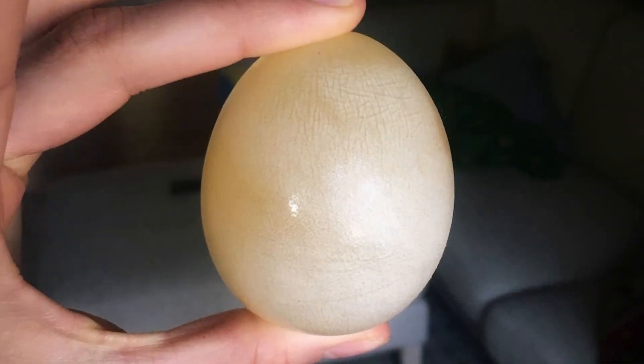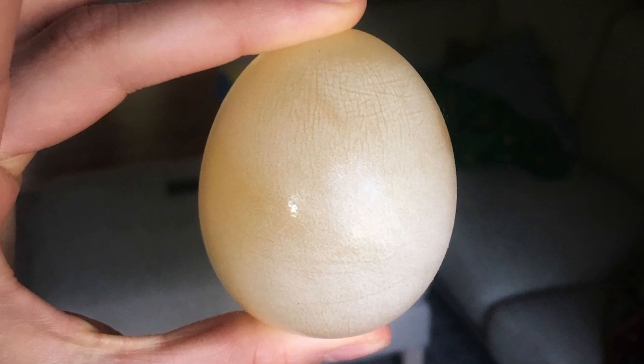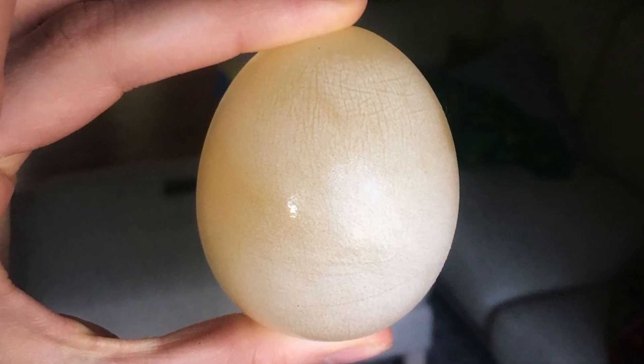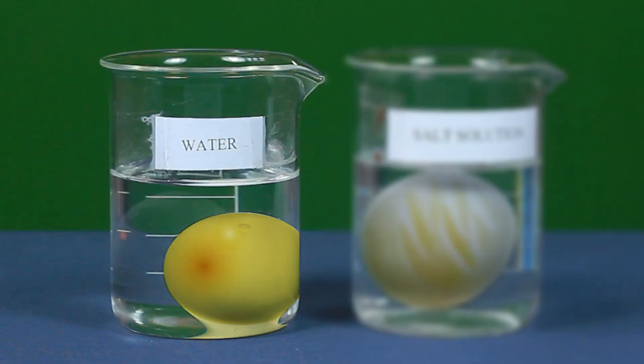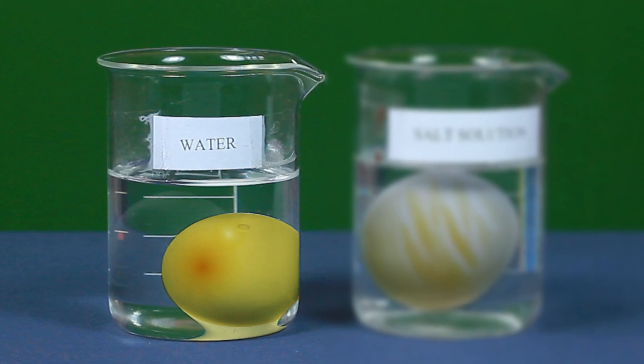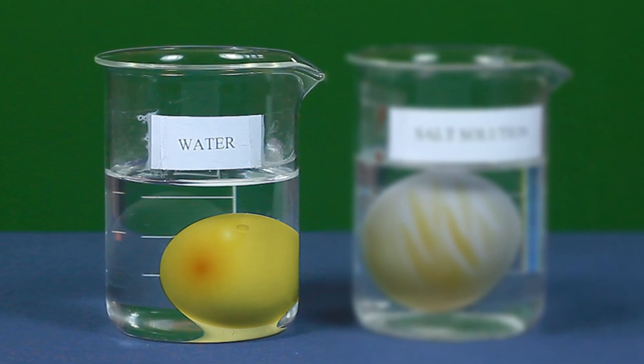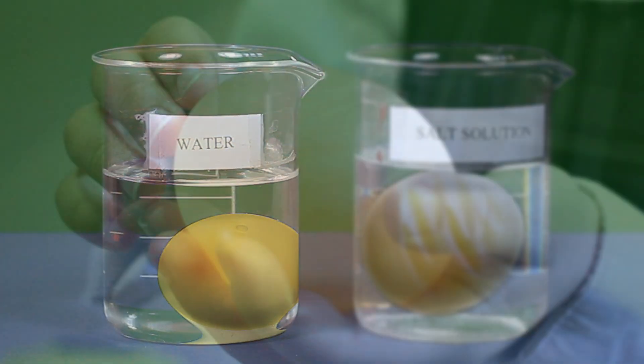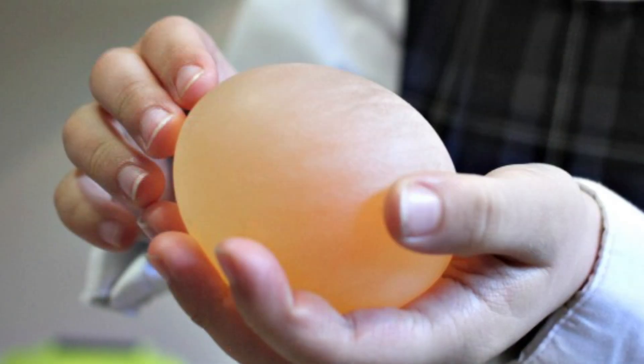The de-shelled egg when placed in water swells because the concentration of water molecules outside the egg is much higher than the concentration of water molecules inside the egg. As a result, endosmosis takes place and water from the beaker enters the egg.